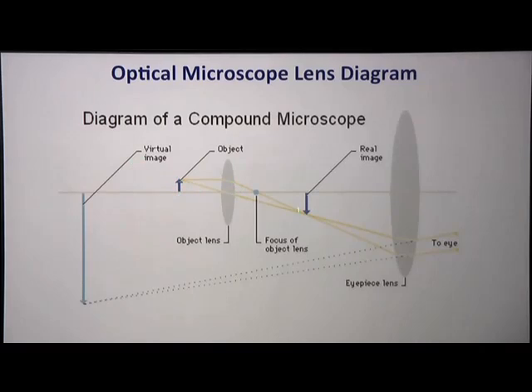And the image, we call it the real image if it's in the opposite focal plane. And if we reproject this onto some detector, we see a virtual image that can be magnified. Right? So this is the virtual image, this is the real image, this is the object, this is the lens. And this would be what we would call a projector lens in an electron microscope. Okay, so if all microscopes are built this way, how is an electron microscope built? We'll get to that in a minute.